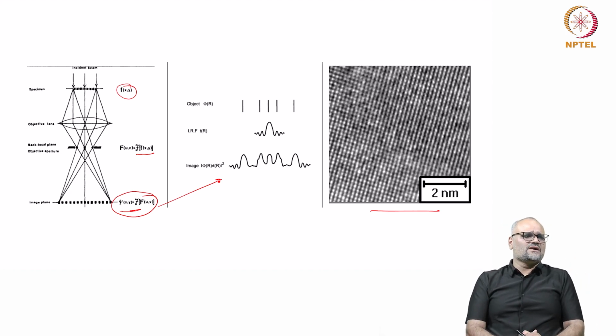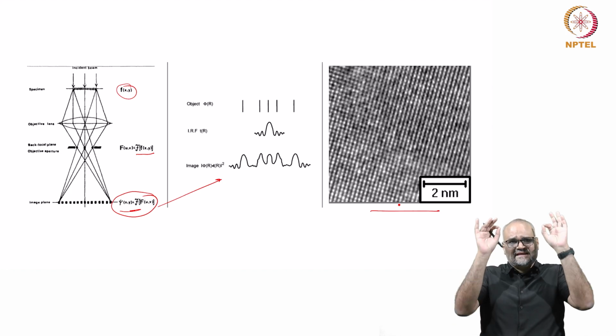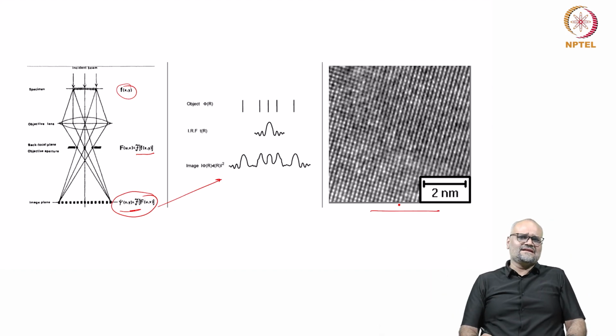So what is important here is that the image that you see here on the right, which appears like a periodic pattern, is not really the image of an individual atom. But if I consider these atoms as scattering centers, if I isolate two exclusive atoms and then start building on how the interference pattern is generated, I see some sort of a fringe pattern.